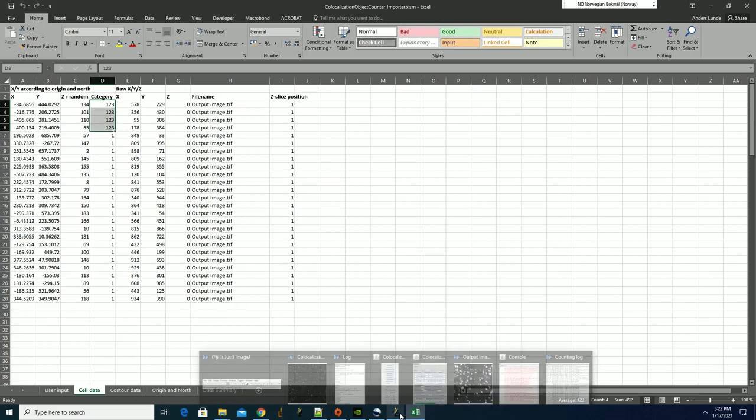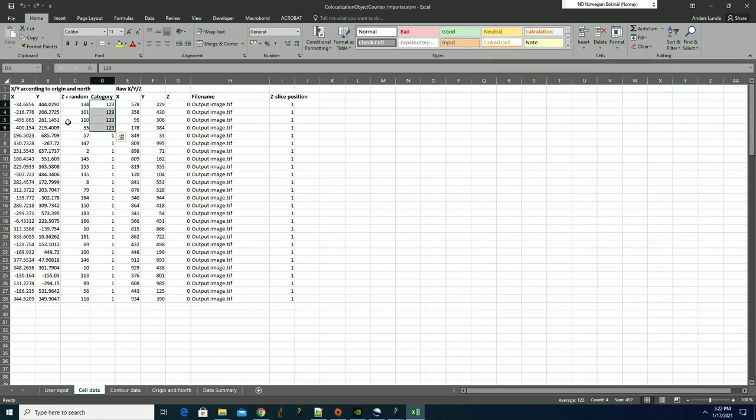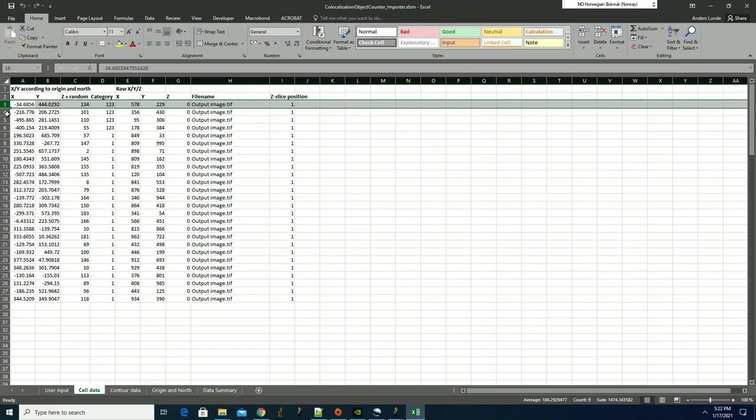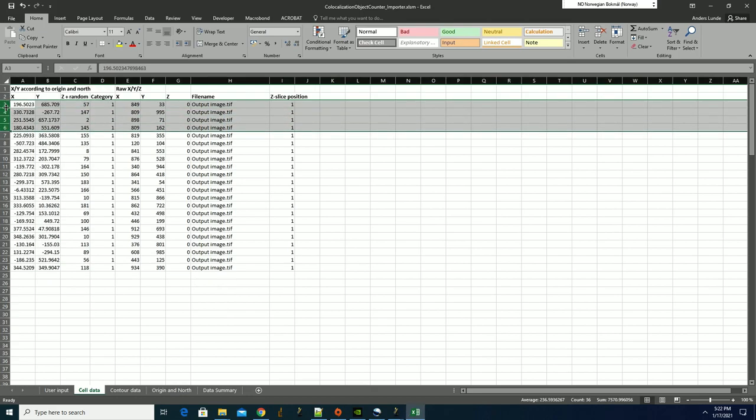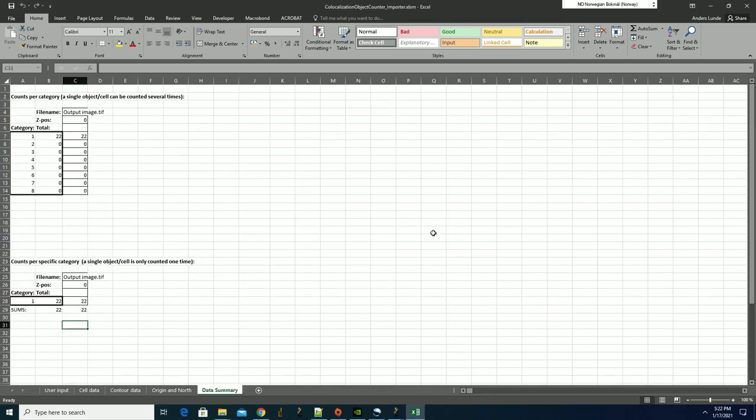So you see, if you remember, we had this here. Let's delete all of those, and then they should disappear from the summary. Yes, now we only have category 2, category 1 I mean.